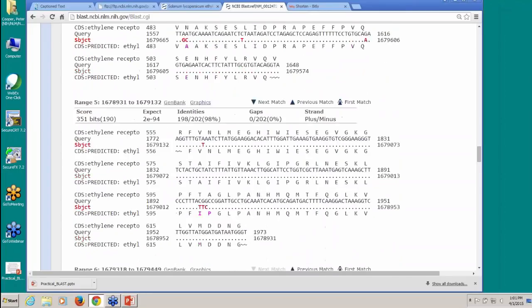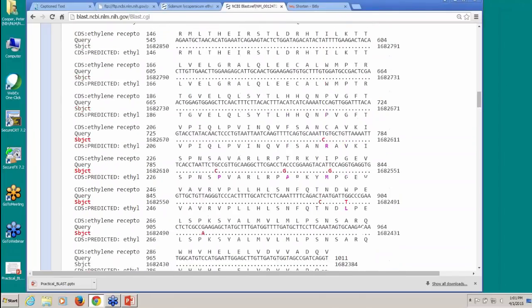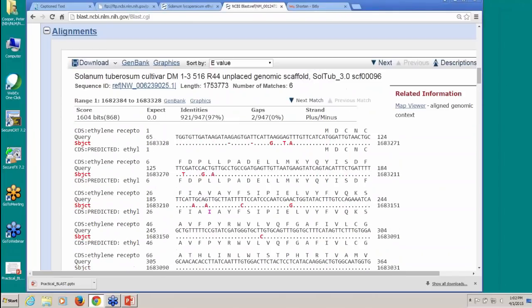This particular case, these are in exon order. Sometimes they're not. By default, they're ordered by score, by the e-value really. Just arbitrarily, this happens to be the order that the exons are in. So if you change it to query start position, for example, it doesn't do anything. The query start is right here. Now notice we're missing the first 65 bases of this.